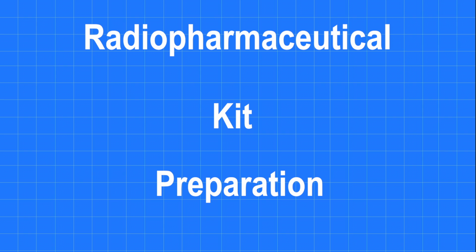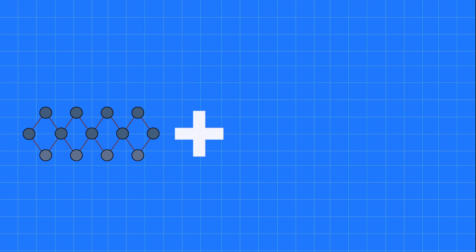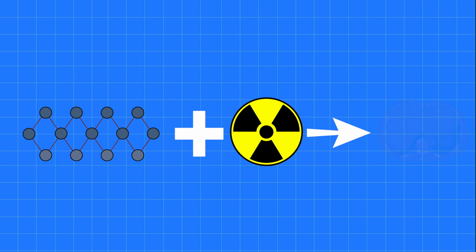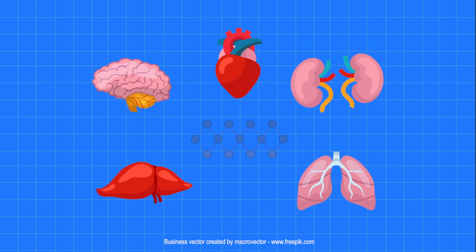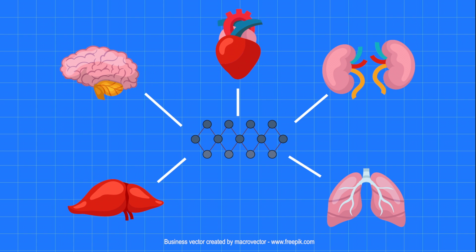A radiopharmaceutical is a chemical compound tagged with a radionuclide administered to a patient for a specific diagnostic purpose. For diagnostic use, they are administered in tracer quantities and delivered to specific target organs.